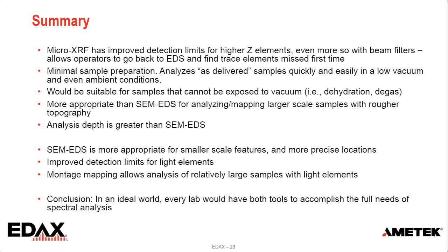The sensitivity improves with increasing Z, but there's no stage scanning option. So the micro-XRF utilizes the benefits of conventional XRF while implementing micro-spot X-rays with a movable stage. In micro-XRF, the smallest spot size can be around 20 to 30 micron.